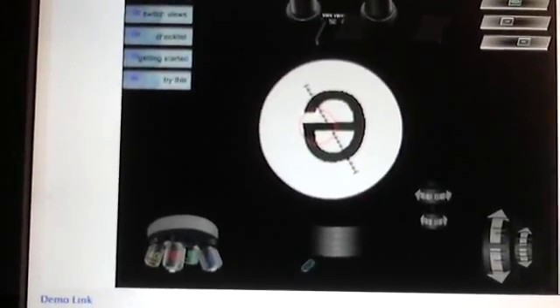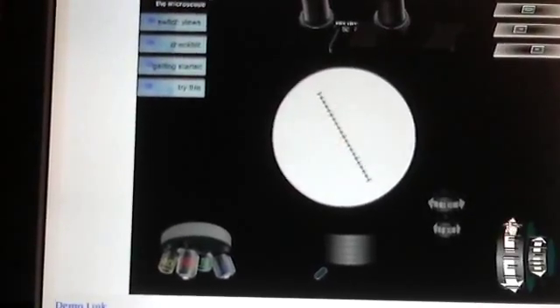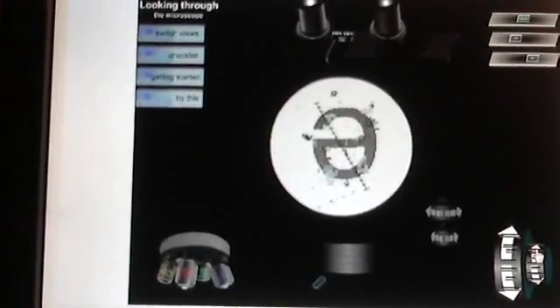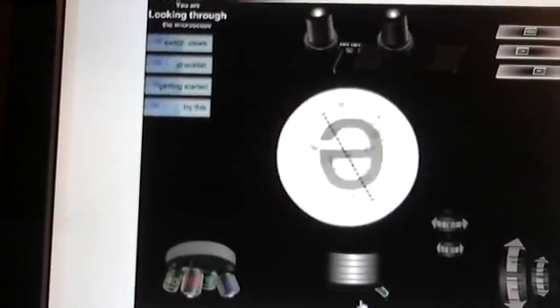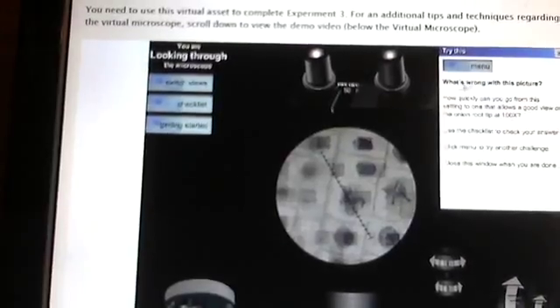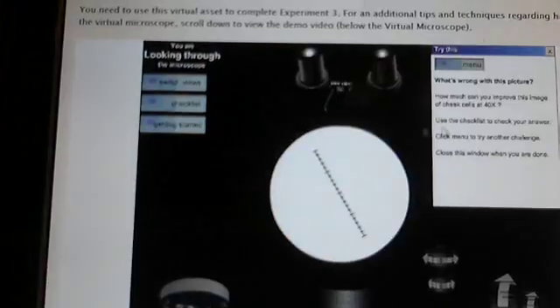Then it says the E no longer fits in the field. So rotate it until it no longer fits. The best way I could get it was it would come back, and I couldn't get it to get any bigger, but I also saw where I could try and it would work with me also.